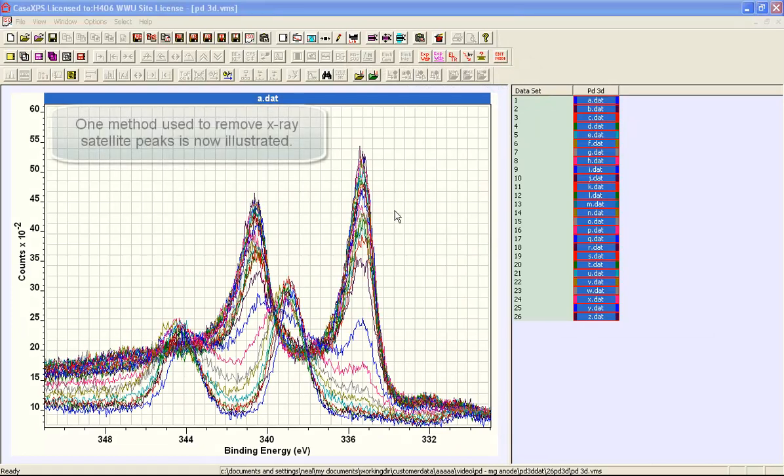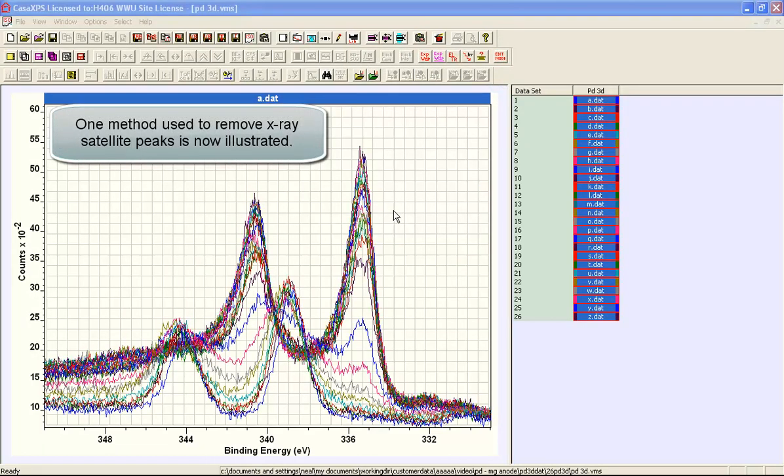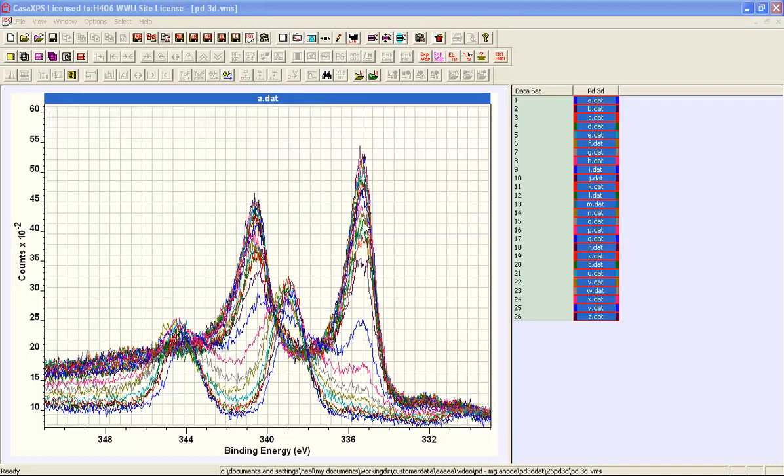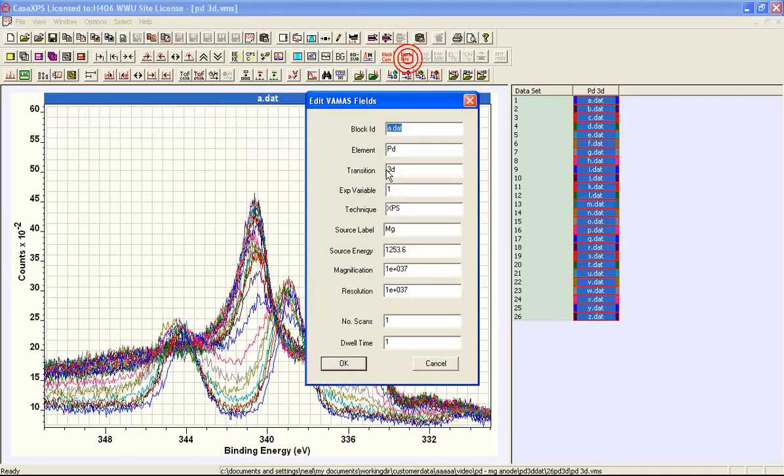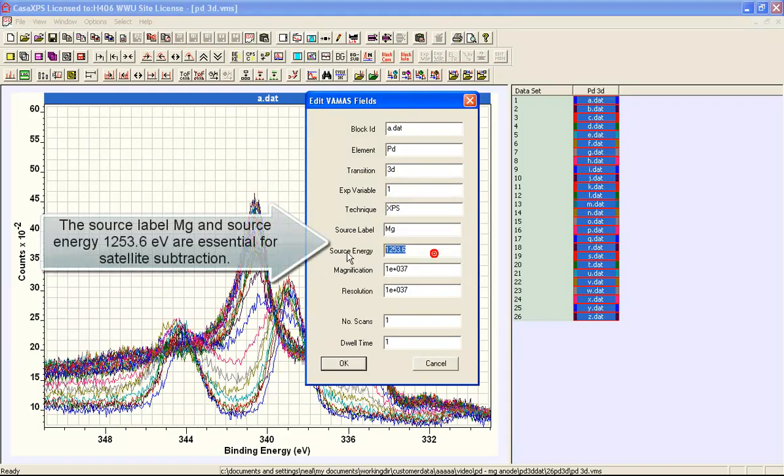Since these data were collected using a magnesium anode and we specified a magnesium anode when we converted these data, the information that's within the VAMAS block includes the fact that we do have a source which is magnesium.